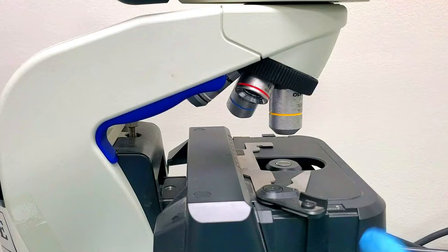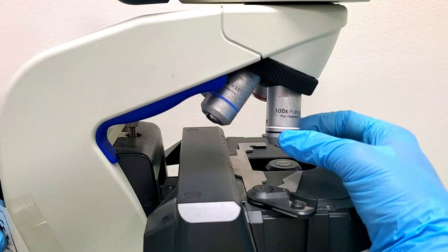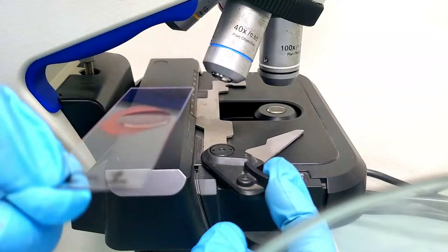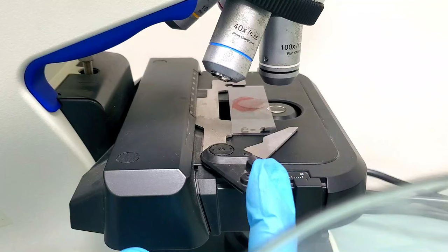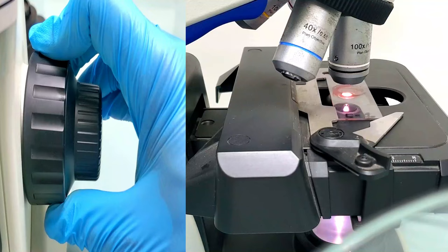Set the microscope at 100-time magnification using the 100x lens. Place and lock the glass slide on the microscope stage. Turn on the light source. Now adjust the microscope to observe the bacteria at 100-time magnification.